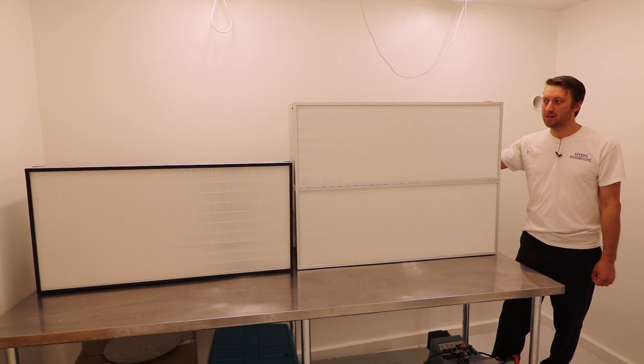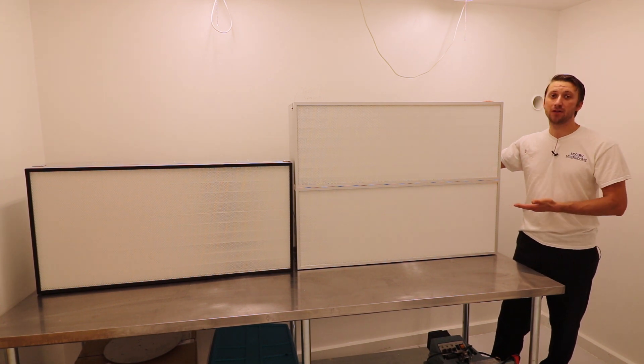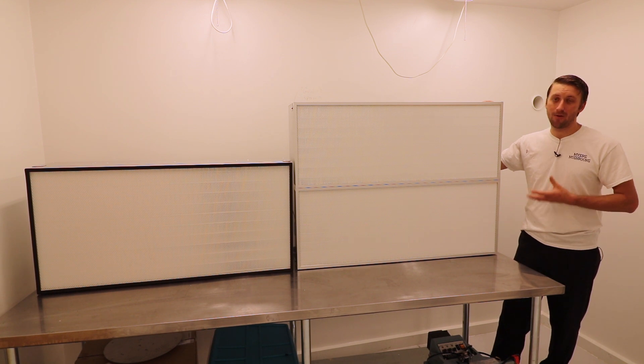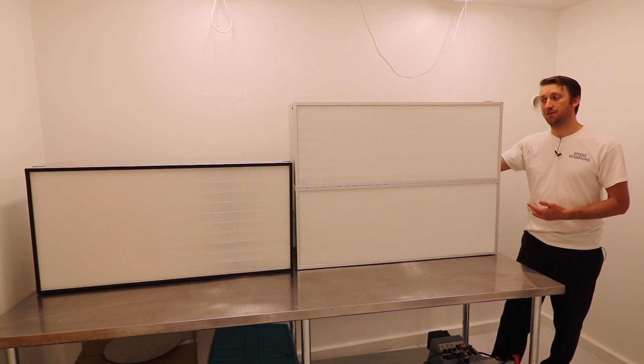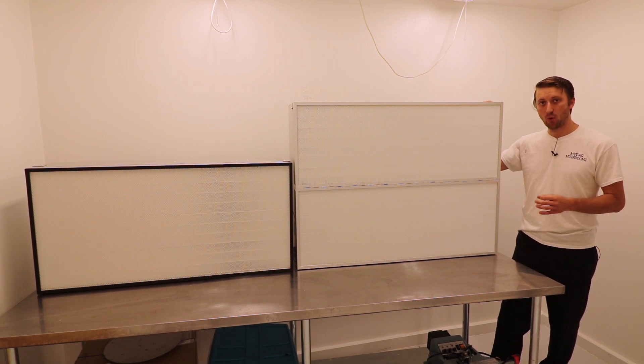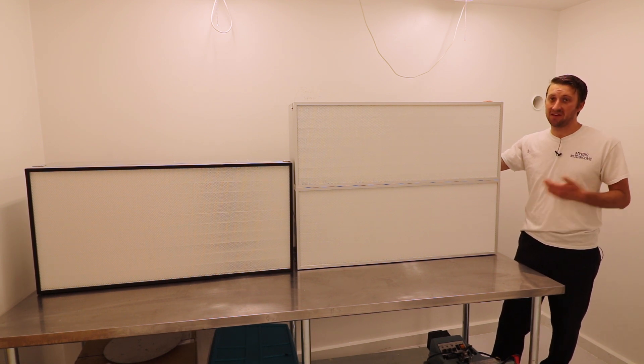These are the new fan filter units that I'm selling. These are HEPA filters. They are basically plug-and-play flow hoods. They flow around 100 feet per minute. The filtration is 99.99% at 0.2 microns, so that is HEPA rated.